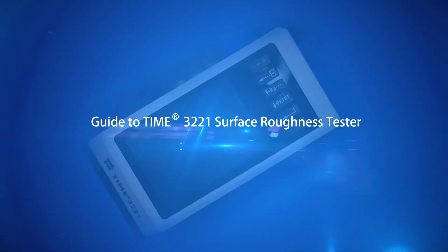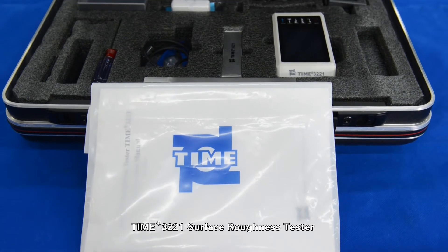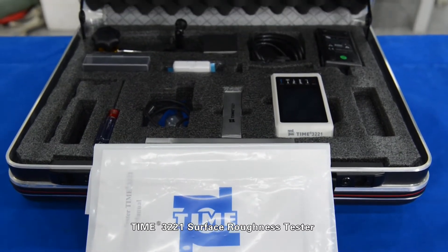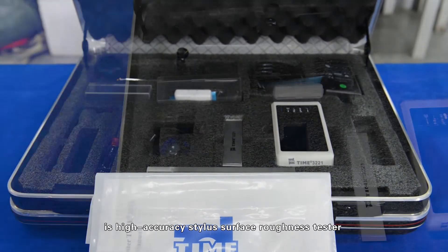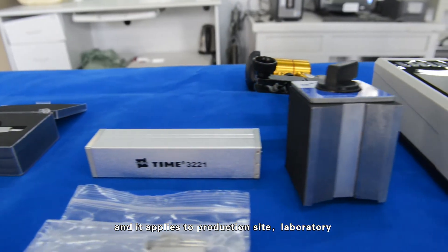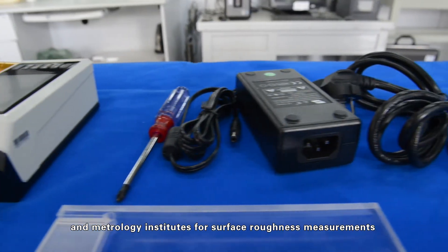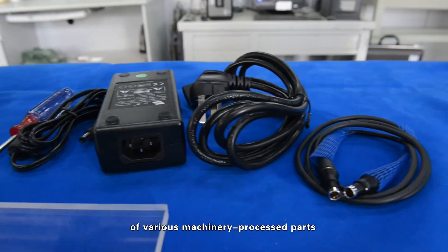Guide to Time 3221 Surface Roughness Tester. The Time 3221 Surface Roughness Tester is a high accuracy stylus surface roughness tester. It applies to production sites, laboratories, and metrology institutes for surface roughness measurements of various machinery process parts.